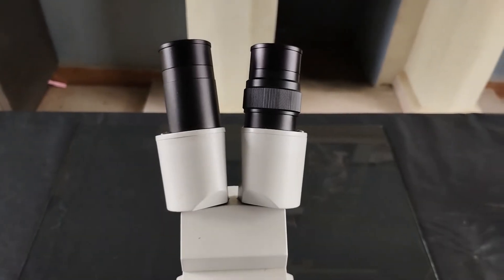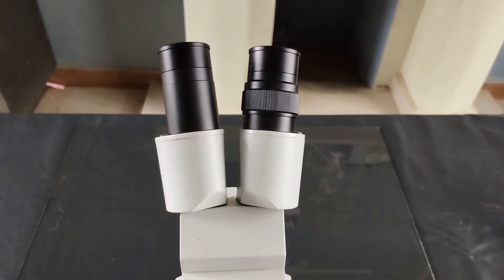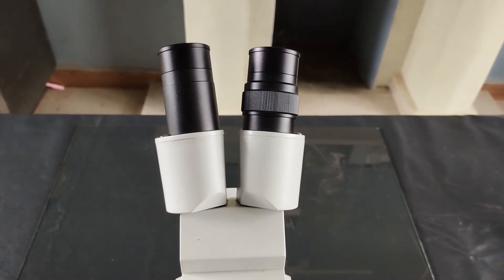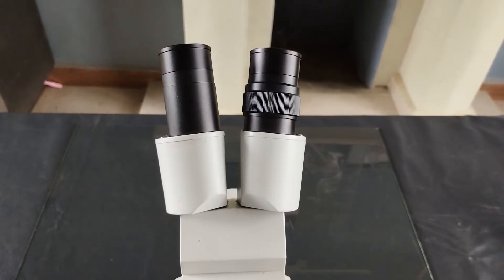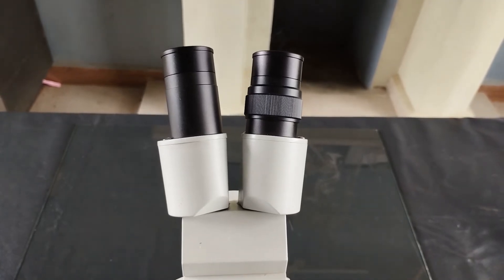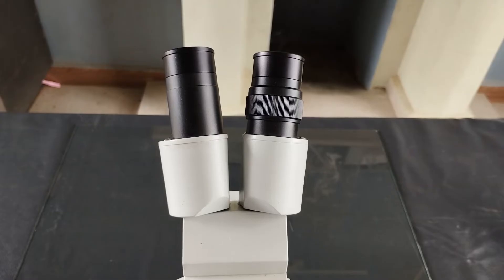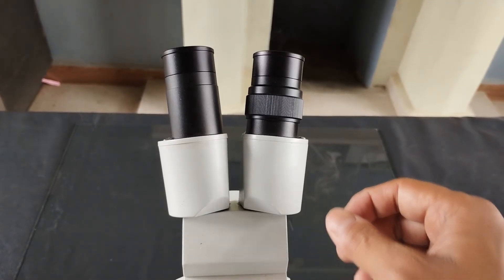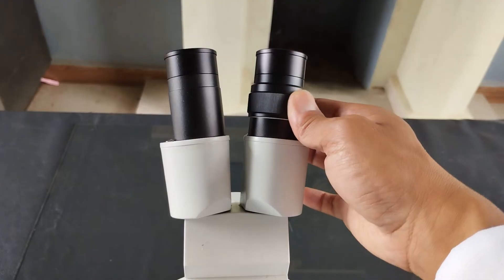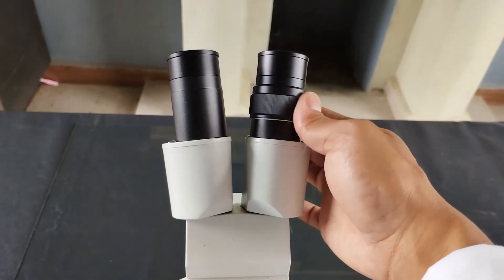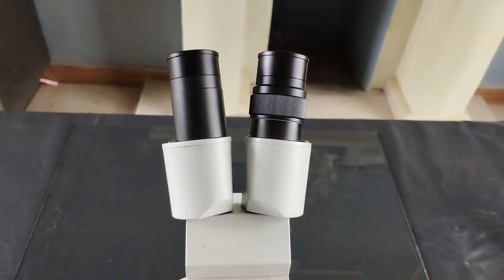Now, before actually beginning to examine the specimen, you'll need to make sure that the focus of both eyepieces are aligned with respect to the powers of both the viewer's eyes. Just as in the binocular light microscope that I've covered in a previous episode, the ocular tube of one of the eyepieces in a stereo microscope, usually the left eyepiece, can be rotated to adjust its focus.